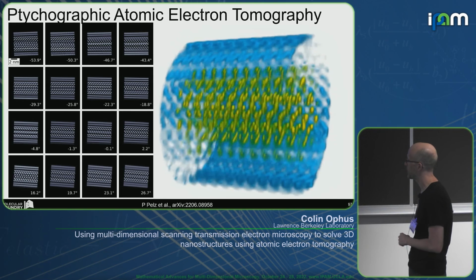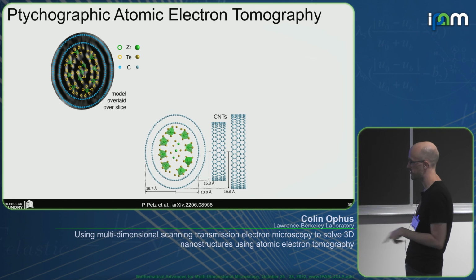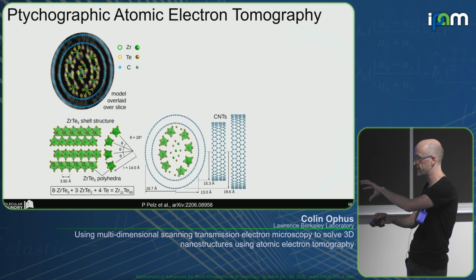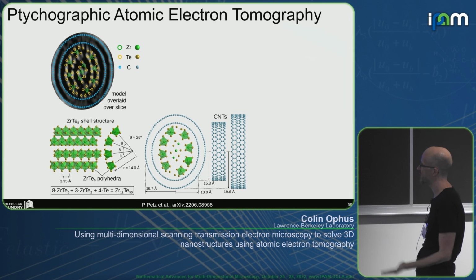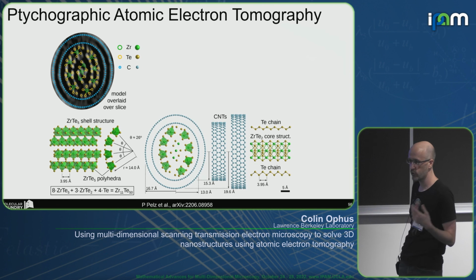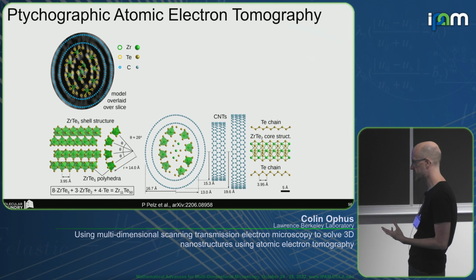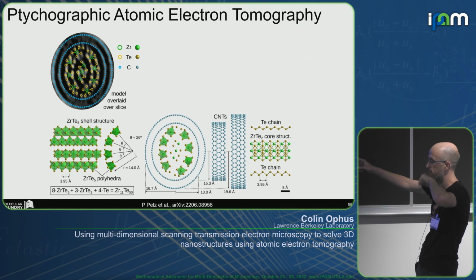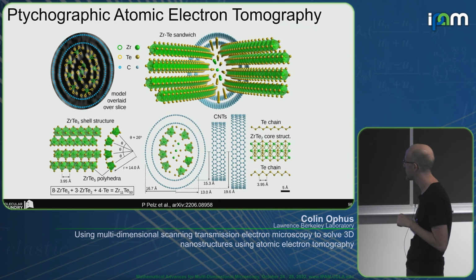And so in the interest of time, I will spend no more than 30 seconds talking about it. It has a two sort of layer structure inside. It has this previously observed zirconium tellurium 5 structure, but instead of in an orthorhombic, like alternating direction configuration, it has this really cool elliptical curve sort of reconstruction on the inner left and the inner right. The other thing we discovered is zirconium tellurium 2, a phase that had never been observed before in this particular arrangement of atoms. But interestingly, the way the atoms are arranged is the same as the zirconium tellurium 5, just without the extra 2 further away tellurium atoms. So we do think it's a realistic structure, and we did confirm it with density functional theory.